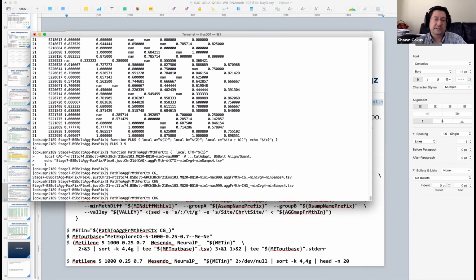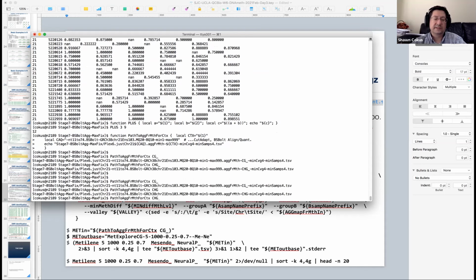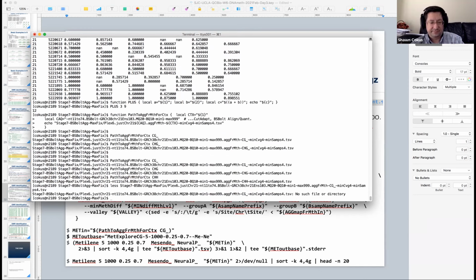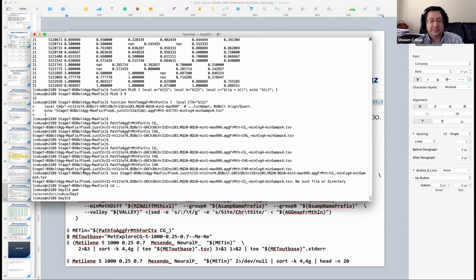So the context, as far as we spell them from the point of view of these files, is like this, right? And its job is to just construct the path to these things. So this is basically the path to the CG version of the file. Oh, because it's assuming your paths are from the day 3 point, not from the subdirectory.